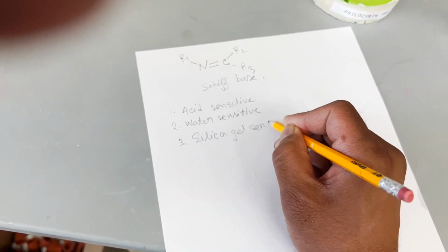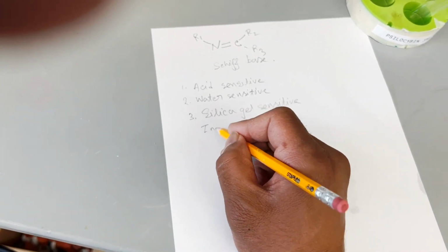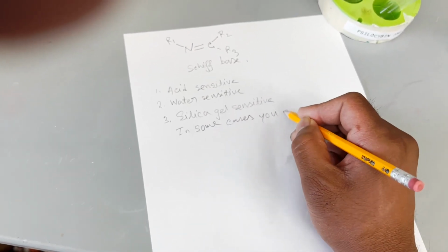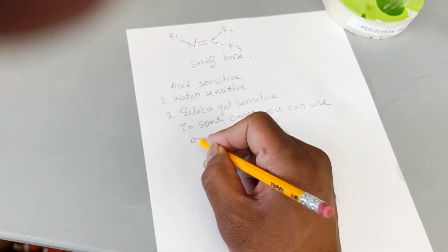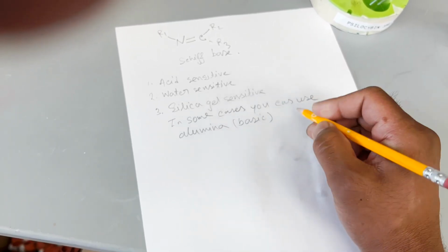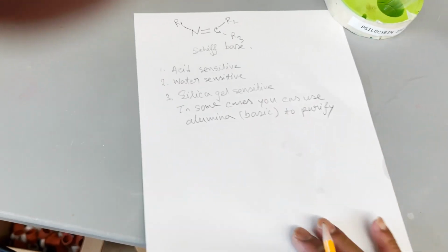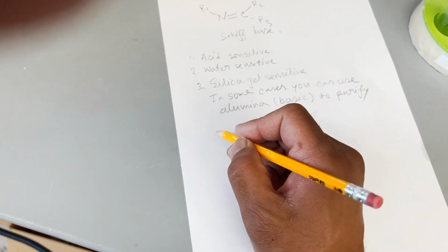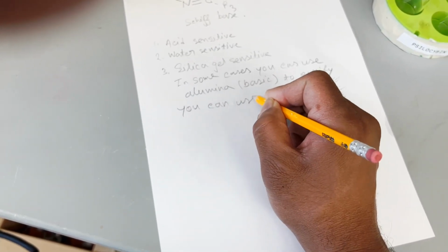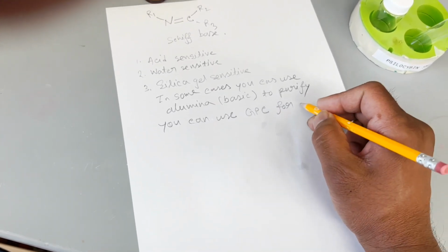As I mentioned, they are acid sensitive, water sensitive, and silica gel sensitive. But another thing you can remember, to purify this kind of compound, if the molecule is larger or of higher molecular weight, you can easily purify this type of Schiff base by using GPC, or gel permeation chromatography technique. So you can use GPC to purify this compound. Sometimes people also use alumina, basic alumina, to purify the compound.